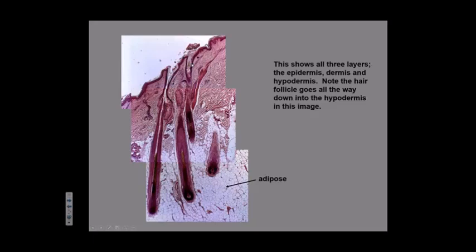Okay? Can I ask a question? That hair follicle on the far left looks like it's going all the way through to the surface, correct? The far left, this one? Yeah. And the next one next to it doesn't look like it's going anywhere. Well, it's because of the way it's cut. Oh, okay. These are really, really thin sections. So you're only cutting thin pieces of all the follicles.